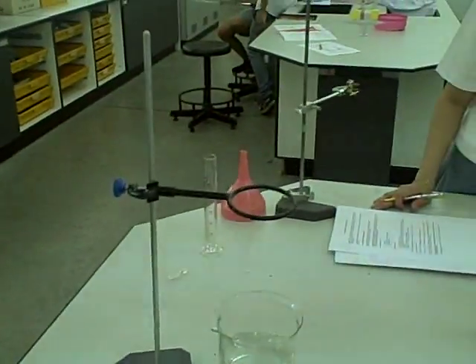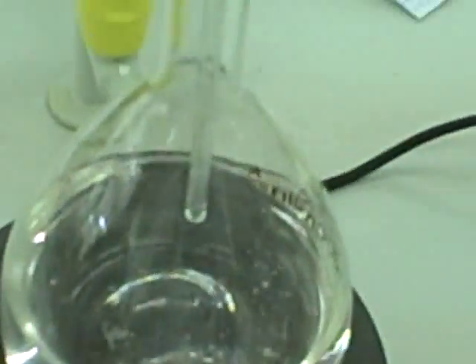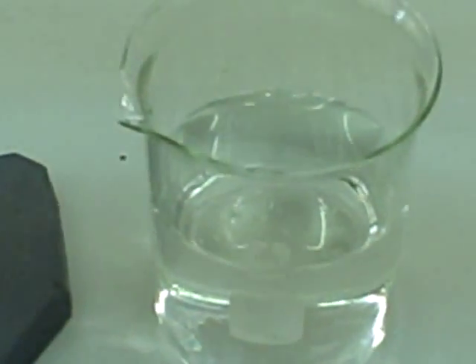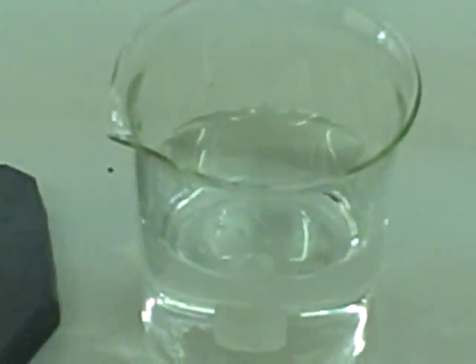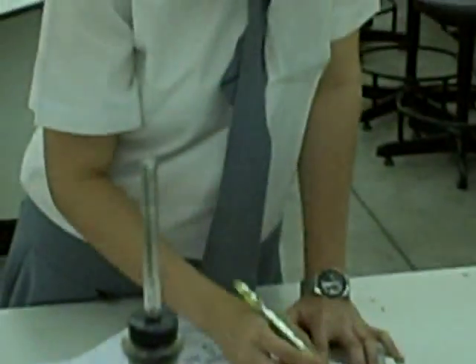We're doing the ammonia fountain. Waiting for this solution of water and phenolphthalein to boil and release steam from the top of the glass tube. In the large beaker we have ammonia solution with water. We're going to invert this — okay, come up here. This might get messy.